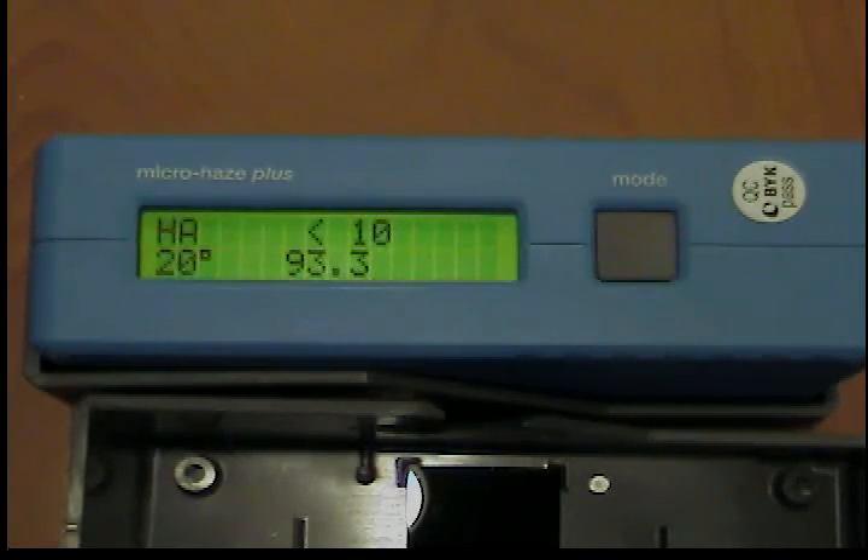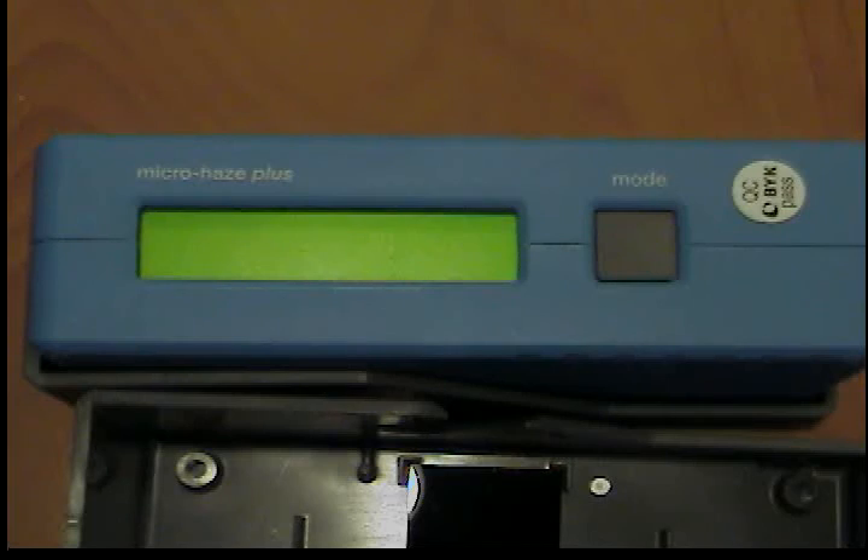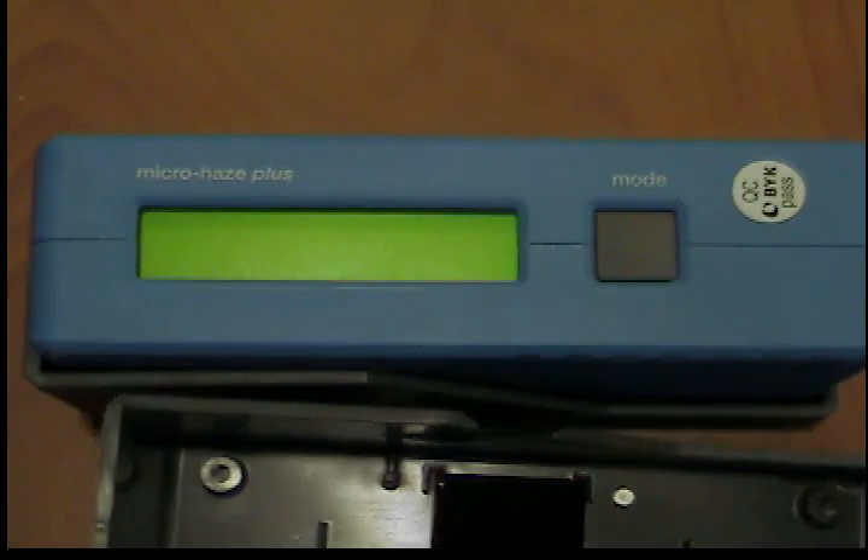Secondary standard. In order to verify the accuracy of the measuring means, measurements should be made at regular intervals using a separate secondary standard. To do so, place the measurement unit into the guide for the standard holder so that the markings on the unit and the standard coincide. Make sure the unit is properly seated. Now perform the measurement as described. The measured value displayed must not deviate from the value printed on the standard by more than a maximum of one unit.